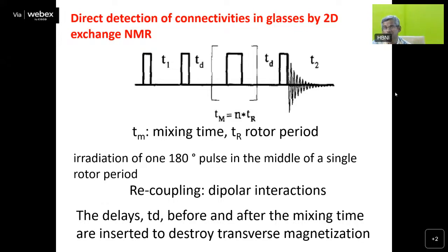Hope you remember. I will not go into that bit, but you go through that in your room or after the class, and we can discuss it maybe next class. So a minimum of 2 pulses is required to record a 2-dimensional NMR spectrum.